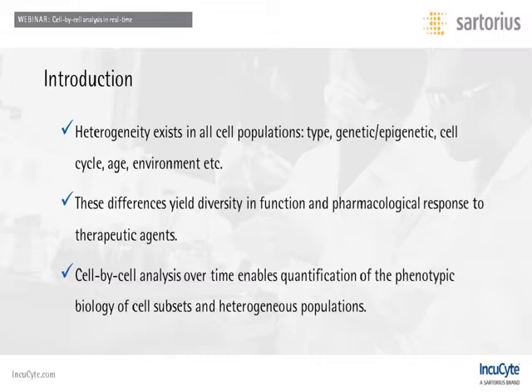Importantly, we should be aware that disease states such as cancer are highly heterogeneous, which goes some way to explaining why there is such a diverse range of pharmacological responses to therapeutics in cancer treatment. Being able to analyse at a cell-by-cell level allows for the study and identification of subpopulations that could potentially be overlooked within population average data analysis.